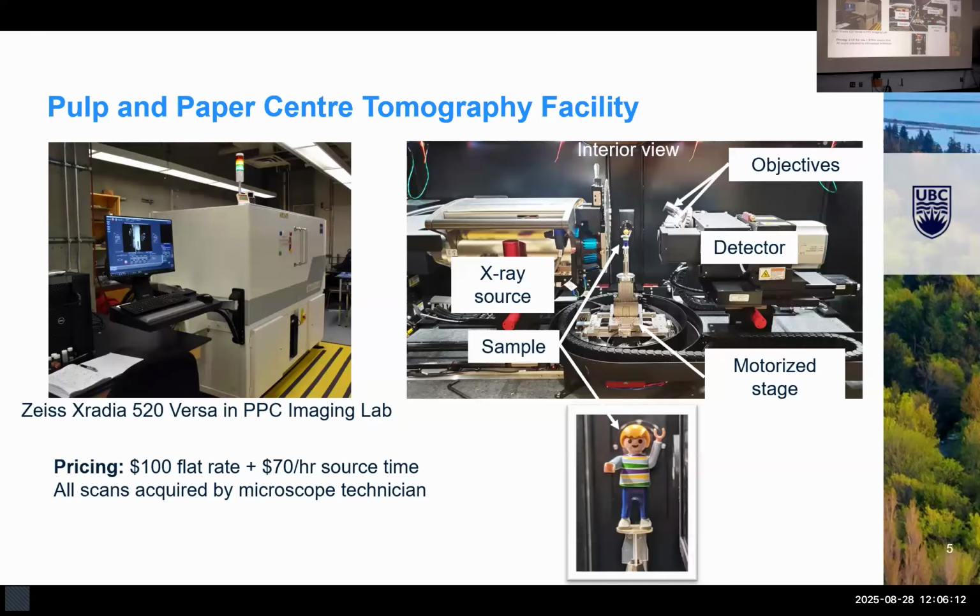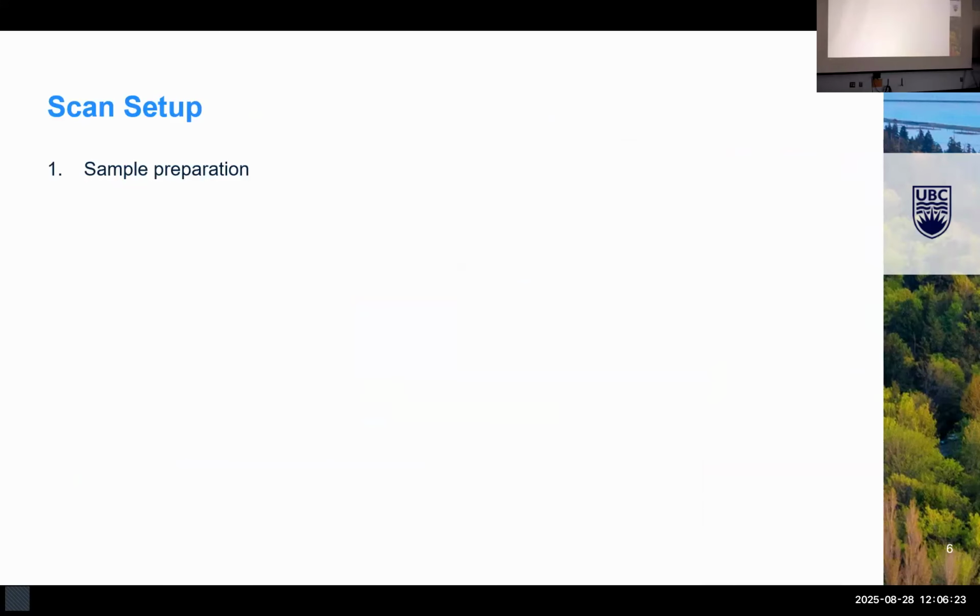But nonetheless, I thought it might be helpful to go through more or less a day in the life of an X-ray microscope technician and how one would acquire a scan. It might be informative for the characterization audience. So one of the first and arguably most important steps is the sample preparation. Although it's typically thought of as a non-destructive technique, it can actually be pretty helpful to destroy your sample a little bit first and get it down to as small as possible.